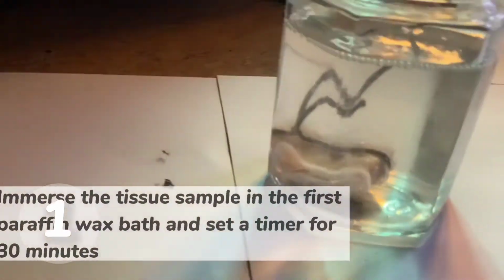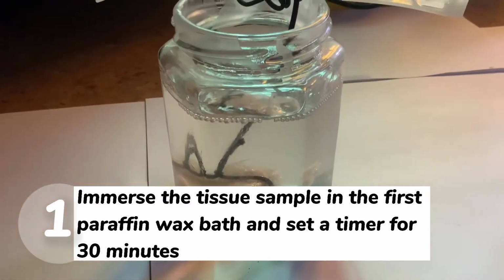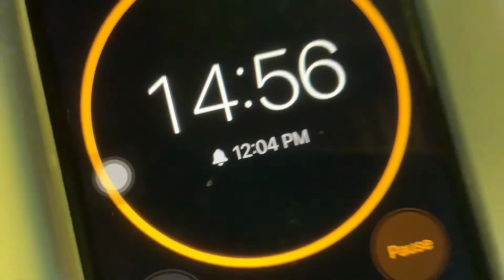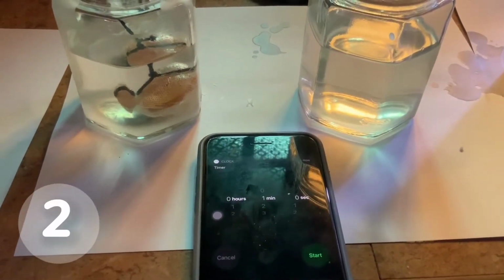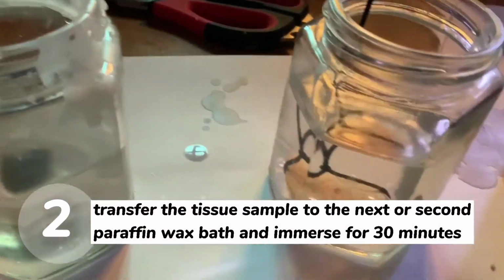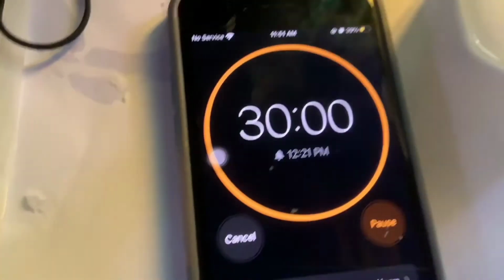So for the first step of the infiltration process, we are going to immerse the tissue sample in the first paraffin wax bath and set a timer for 30 minutes. Once 30 minutes is done, transfer the tissue sample into the next, or second, paraffin wax bath and immerse it for 30 minutes.